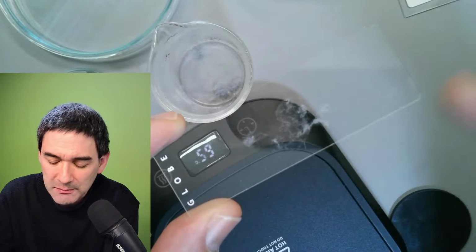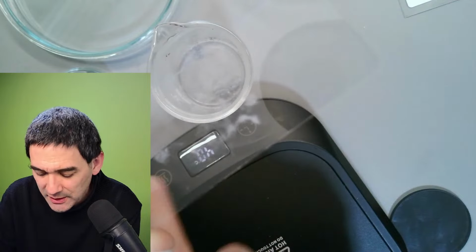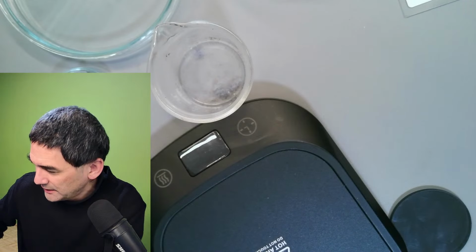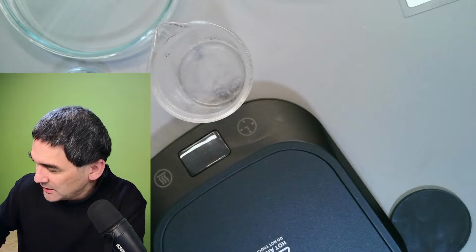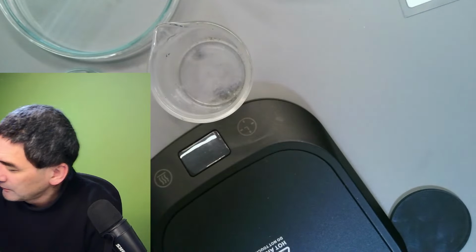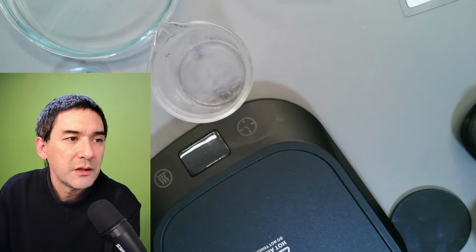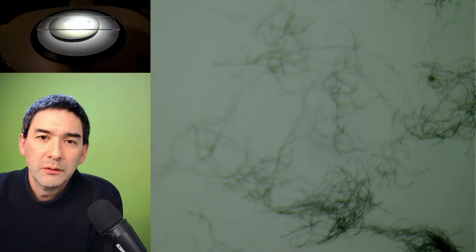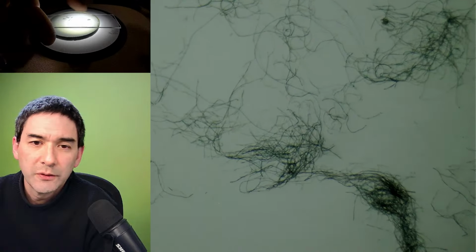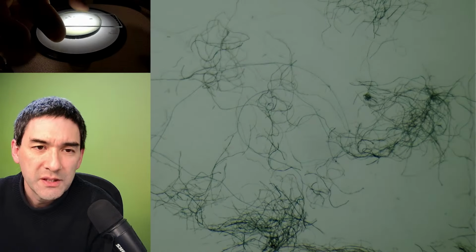Maybe still a little bit too much together, right? But it doesn't matter. Let's try it here. So this is just dust from my table. You need the stereo view again. Here we go, this dust from my table. Let's have a look here first, and you see that the fibers are quite a bit smaller actually.